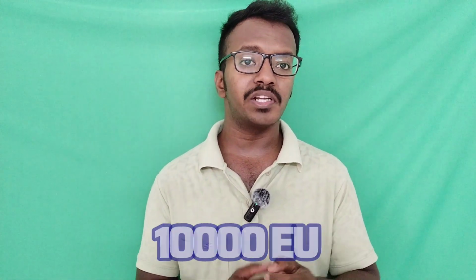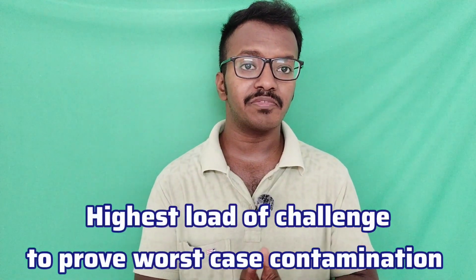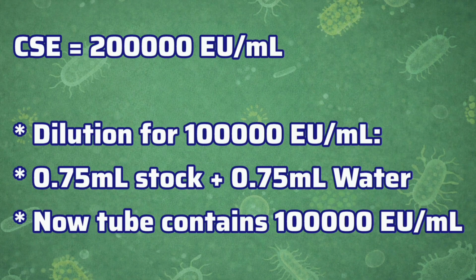We already discussed that a known concentration of endotoxin is challenged or spiked onto each vial. Normally, for a better approach, each vial needs to be challenged with 10,000 EU per vial. Why 10,000 EU? 10,000 is the highest load of challenge to prove the worst case contamination for this study. If an entire CSE control standard endotoxin vial contains 2 lakh EU per ml, it should be diluted to 1 lakh EU per ml. For example, 0.75 ml stock solution is added to 0.75 ml endotoxin free water. Finally, it is converted to 1 lakh EU per ml. This is a stock solution for spiking into vials.